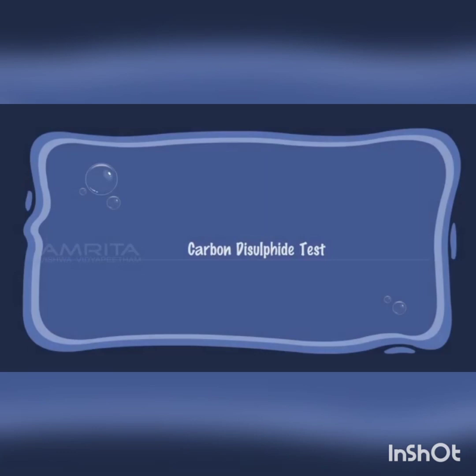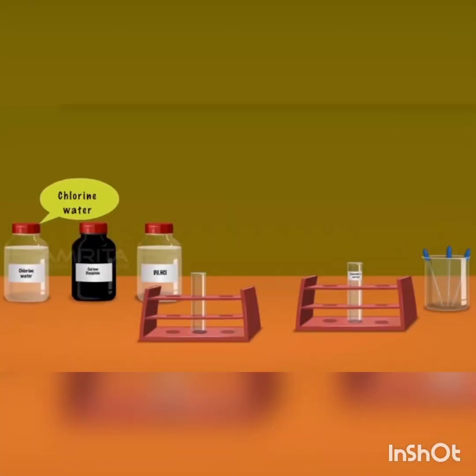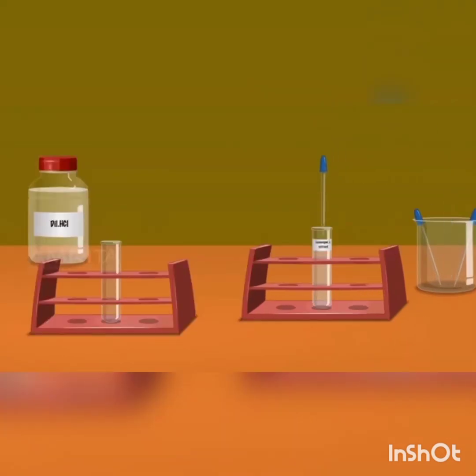Carbon disulfide test. We require chlorine water, carbon disulfide, dilute hydrochloric acid, test tube, Lassaigne's extract, and droppers. Take a small amount of Lassaigne's extract using a dropper and pour it into a clean test tube.